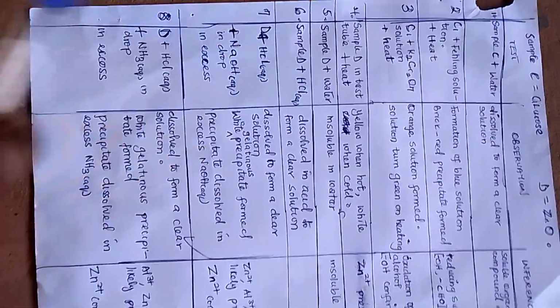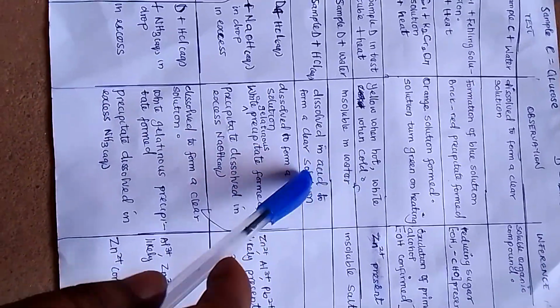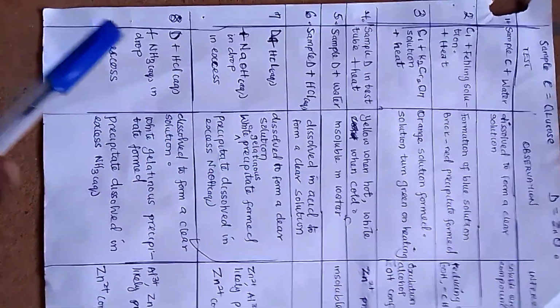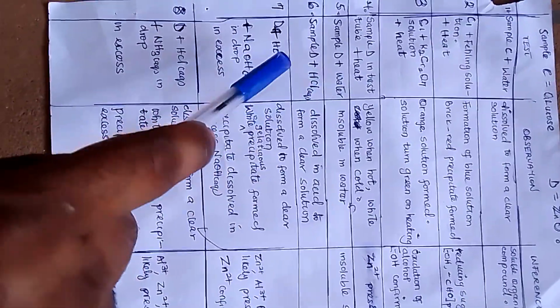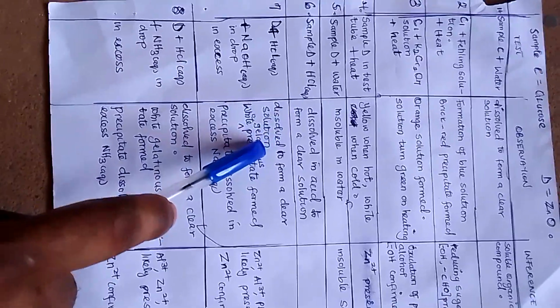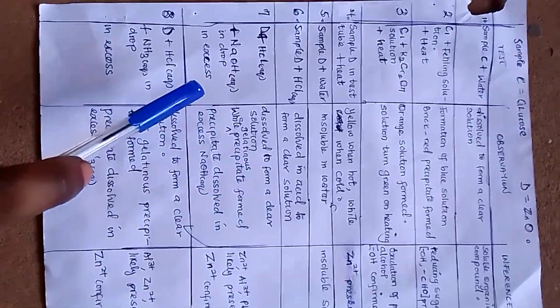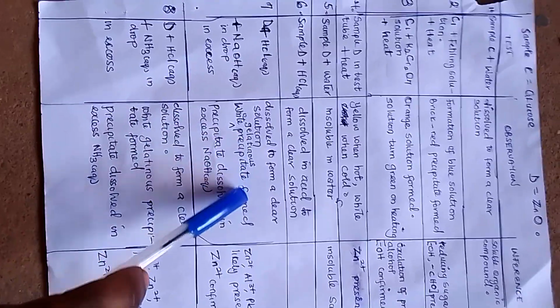So the next one, they might ask you to mix it with acid such as HCl. It dissolves in acid to form a clear solution. Number 7 here, we now say sample D in test 2, with HCl and sodium hydroxide dropwise and in excess. Don't forget that sample D will dissolve in acid to form a clear solution. So when you now add sodium hydroxide to it, definitely you're going to have a white gelatinous precipitate form.